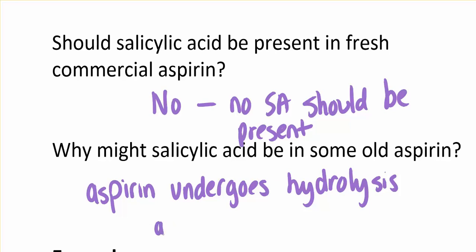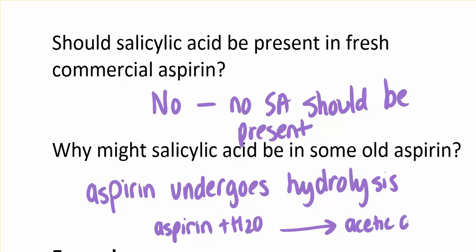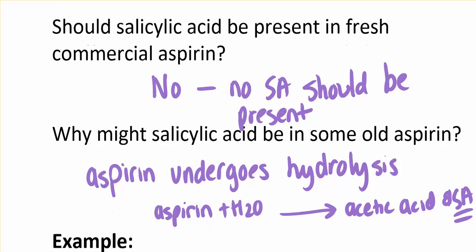If aspirin combines with water in the air, you can get hydrolysis, which will give you back your acetic acid and salicylic acid. And the salicylic acid is what tests positive. So if you test some older commercial aspirin, it may turn purple because it may have some salicylic acid in there due to hydrolysis.